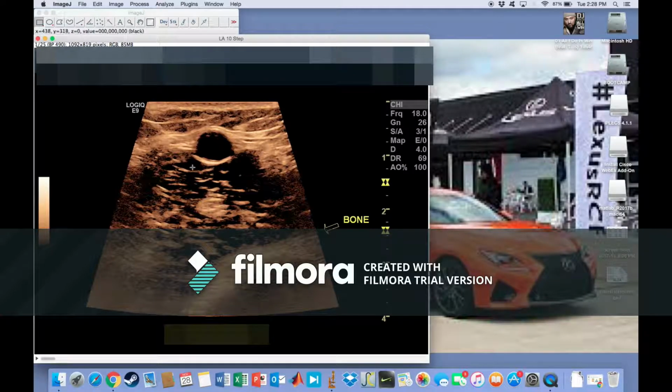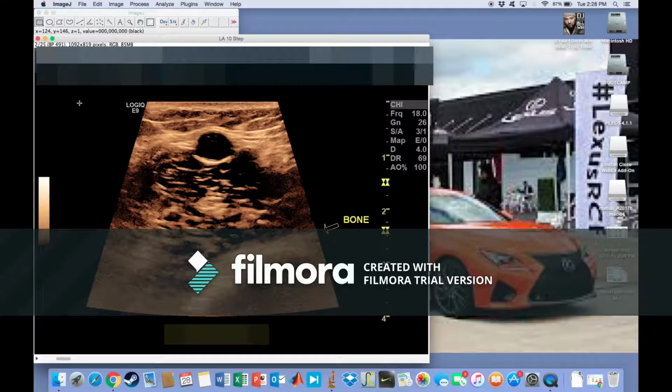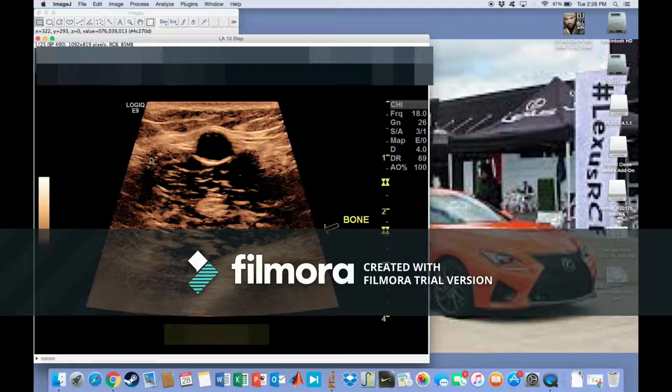Alright. So now that we have those images up, you can tell right here as well that you're on image 1 of 25. You can use your arrow keys to shift through all the images for you and then back out, as well as using the up arrow key to zoom in and the down arrow key to zoom out. Those are just a couple of simple little tasks for you that can be a nice helper. And I will zoom in here.